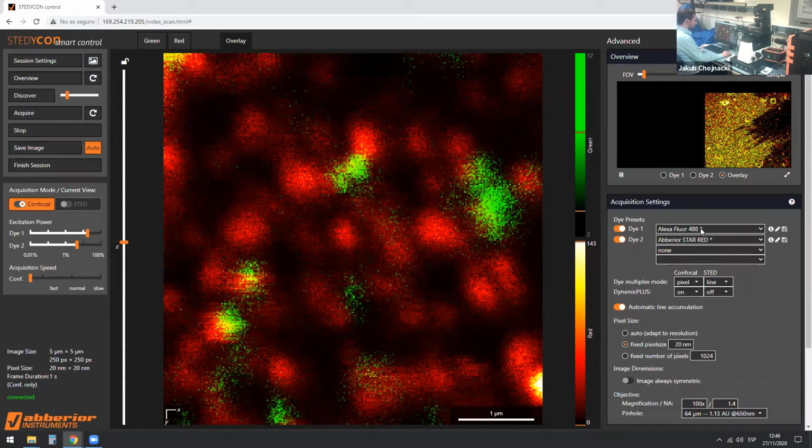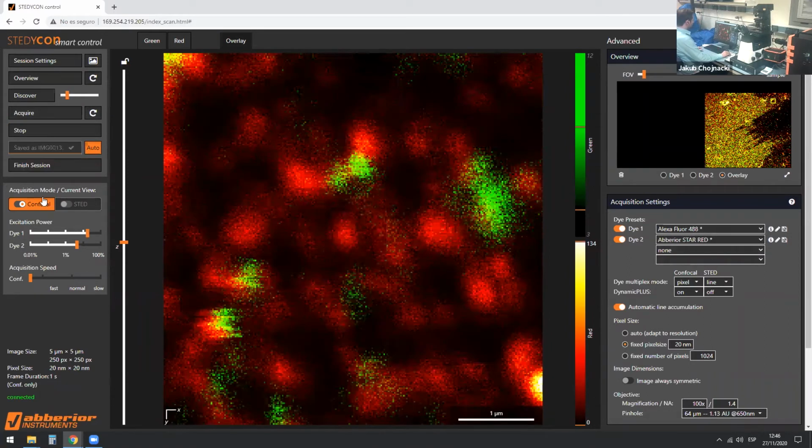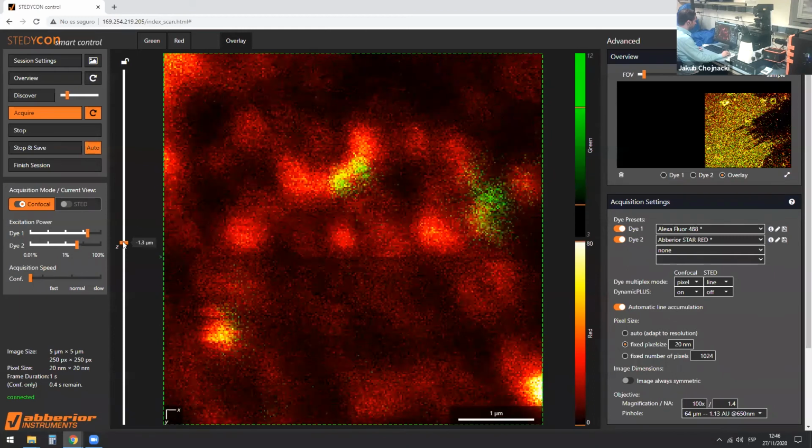Okay, so let's take an image using a standard confocal microscope. How does a virus particle look using a standard microscope? Let's take an image right now. Well, as you can see, you do not see very much. You see some not so bright images. I mean, you see individual virus particles. This, for example, here is most likely an individual virus particle. Let me focus a little bit more on them. It's a little bit better.